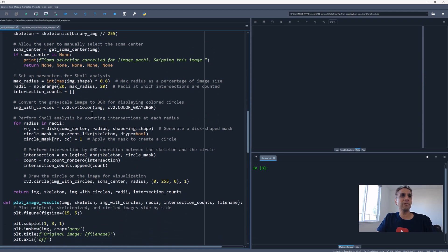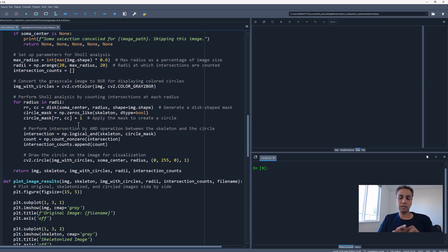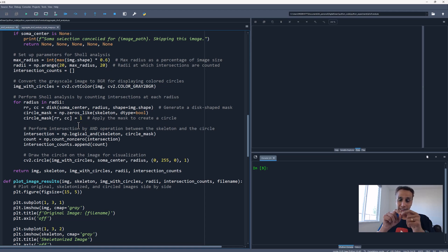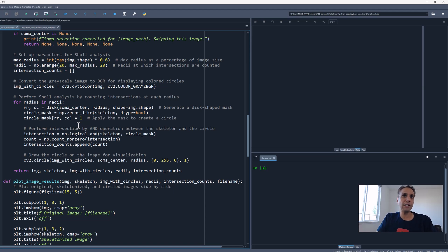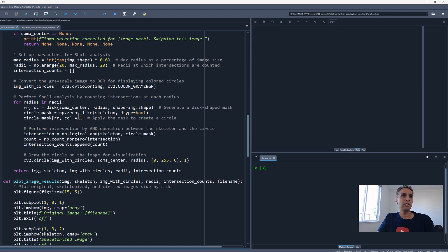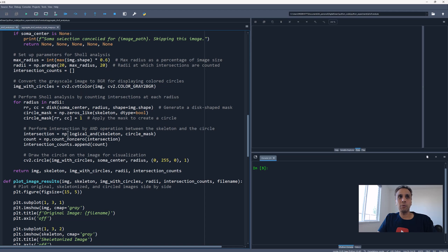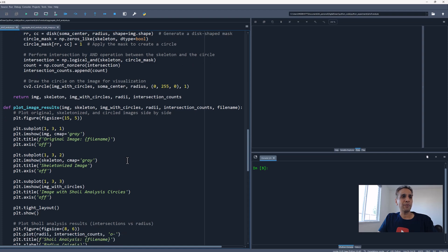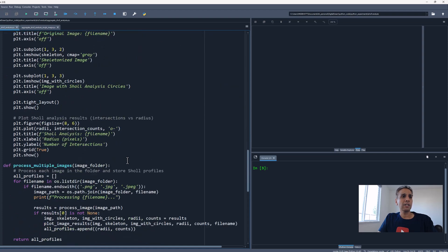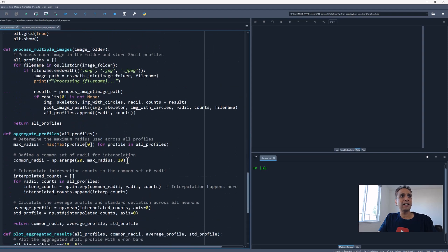For each of these, we are going ahead and looking at the intersection, meaning where my circle intersects with the skeletonized image, the skeleton part. There needs to be a count there, like a non-zero value. In our case it's probably 255 value. That's what we are counting. That's it for each of these images.